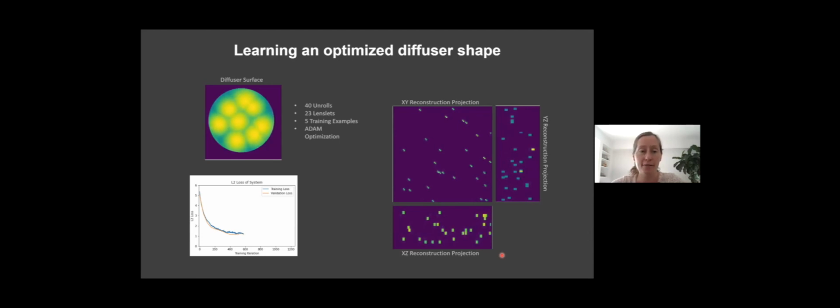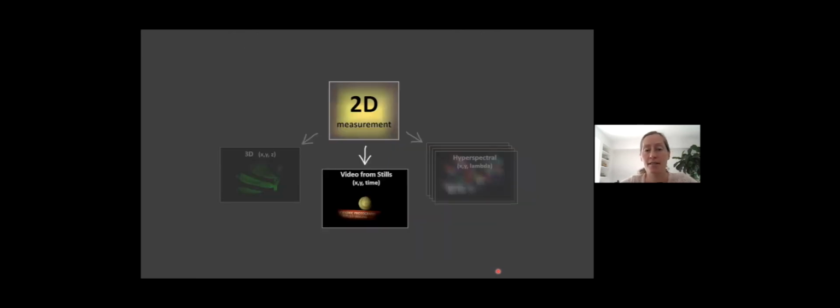You will get a different optimization if you feed it a different class of objects that you're trying to image, or a different range of volumes that you're trying to get good images in. So this is all designed to get single neuron resolution across the biggest volume possible. So I'm really excited about this. This is something that one of my newer PhD students, Eric, is working on for all kinds of different problems. And you'll see more of this later, but I just wanted to give a sense of it.